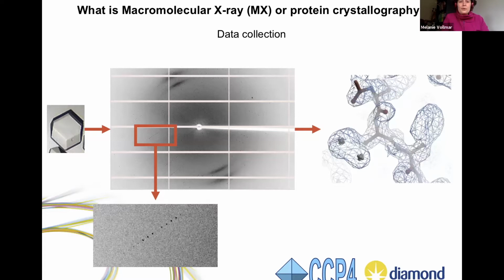If you want to have a structure like that, you can do that with protein crystallography and using a synchrotron. And therefore you use a protein crystal. This one here is, I believe, lysozyme. You put it in an X-ray beam, it diffracts, and you collect the diffraction pattern, those little black spots here, on a detector, integrate those with software, and then you think, yay, that's it all.